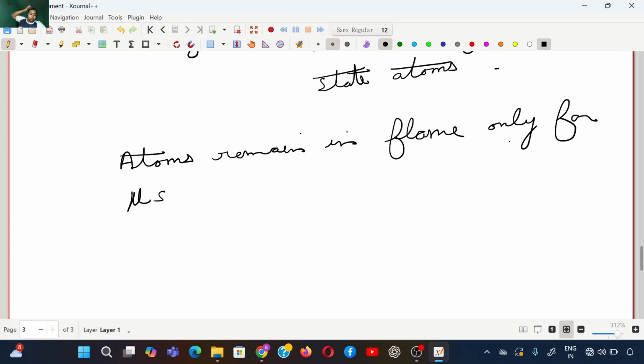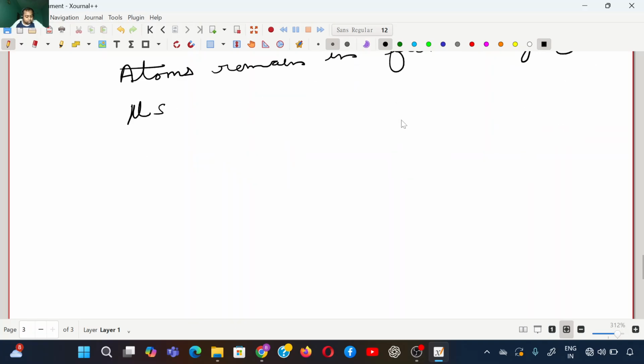They don't last long. And if you dissolve gold in seawater, apart from gold, we'll have various kinds of salts like magnesium, sodium, etc. Those salts will also enter the flame and can affect your atomization process and the readings. So those are some things you have to consider when it comes to the flame chemistry and flame environment. So let us look at some of the interferences in AAS.